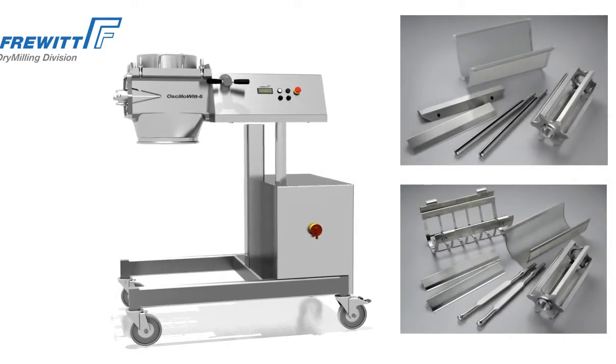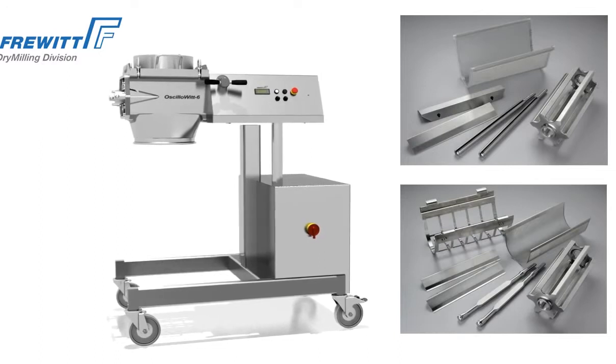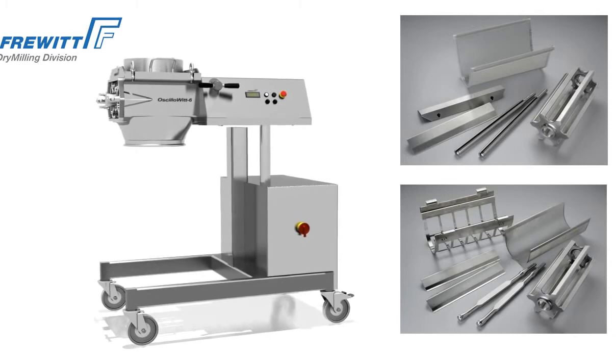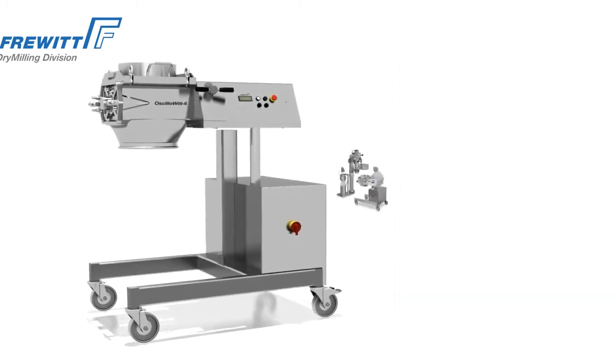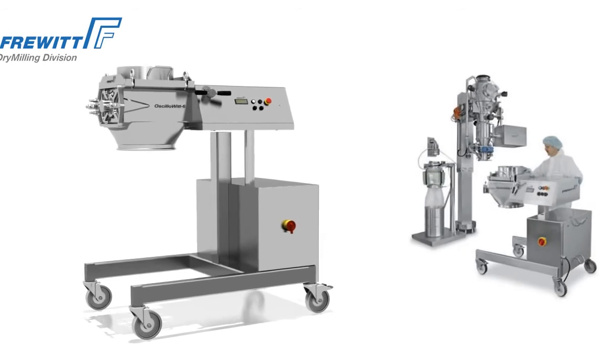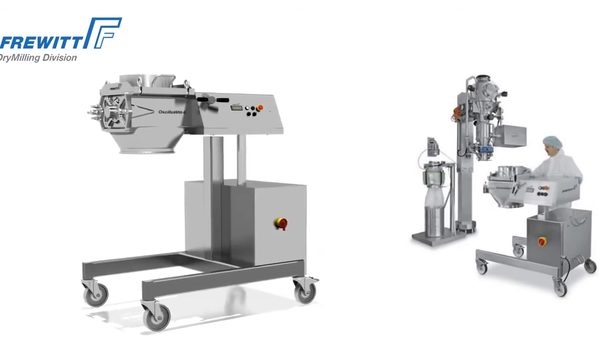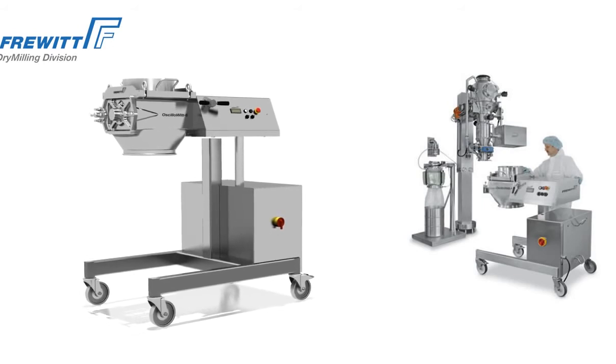Frewit offers you a wide range of accessories for all applications. For example, it is also possible to use sieve inserts with a rigid screen support assembly or direct tensioning rods. The tri-clamp connectors on the inlet and outlet funnels enable smooth integration in your process chain.